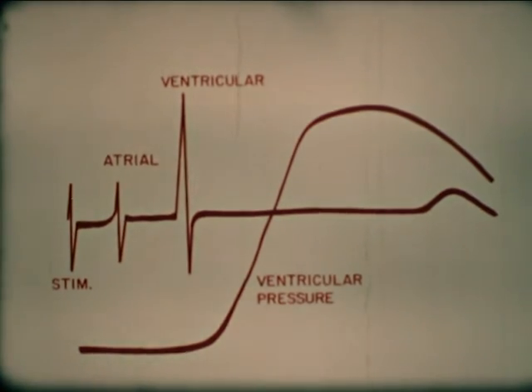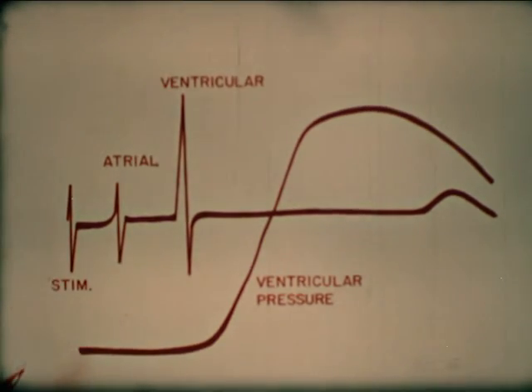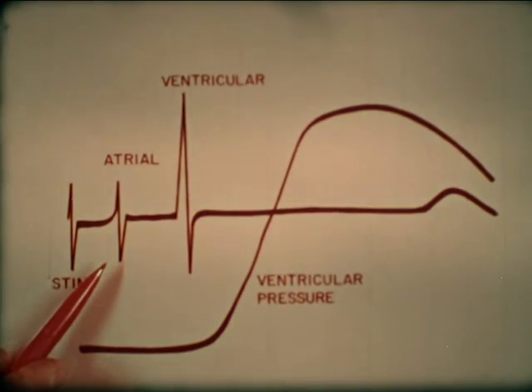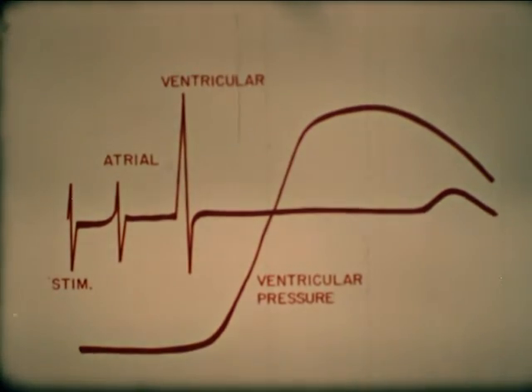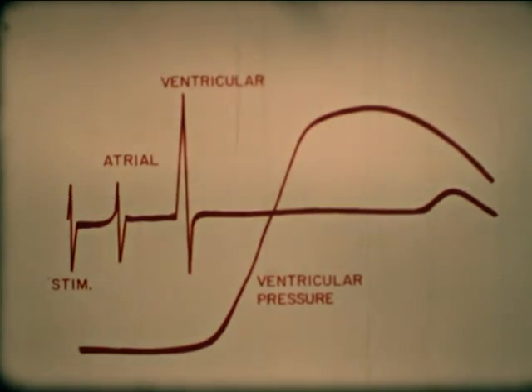The oscilloscope sweep is triggered by the stimulus artifact, shown in this diagram as the large deflection which just precedes the atrial excitation. Under these conditions of constant atrial drive, drug effects on atrioventricular conduction time can be observed.